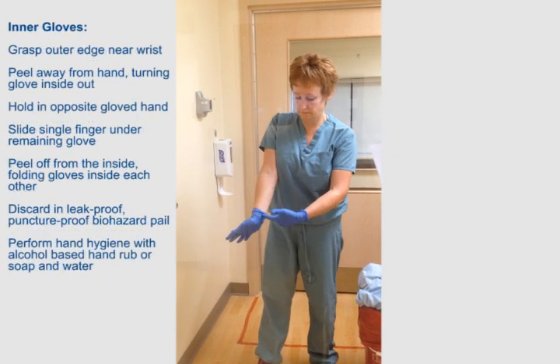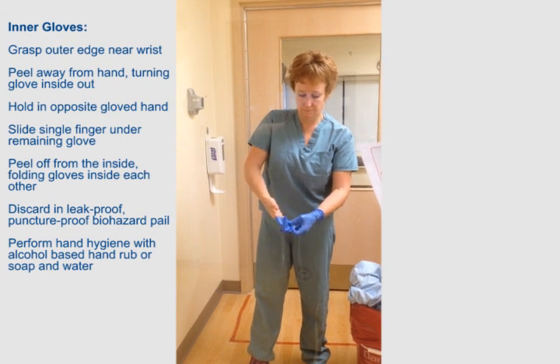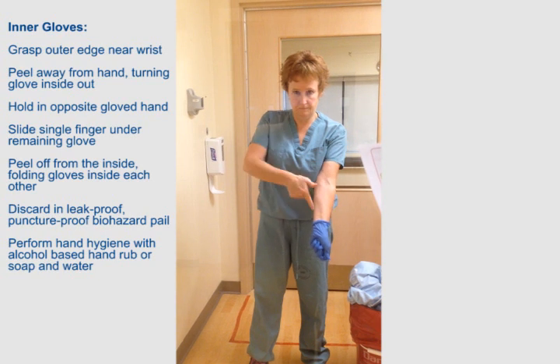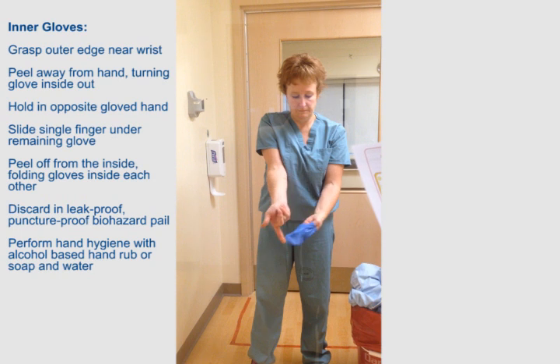Inner gloves. Grasp outer edge near wrist. Peel away from hand, turning glove inside out. Hold in opposite gloved hand. Slide single finger under remaining glove.